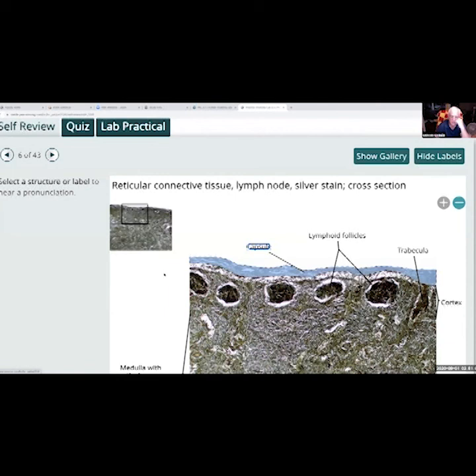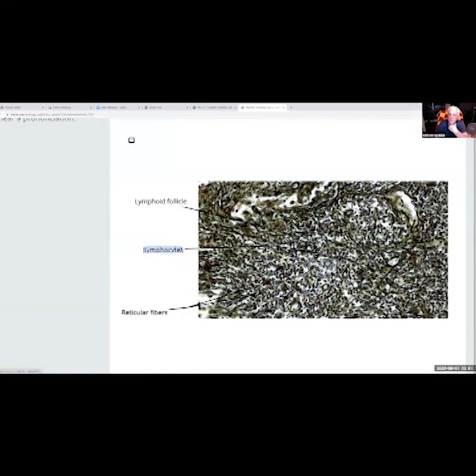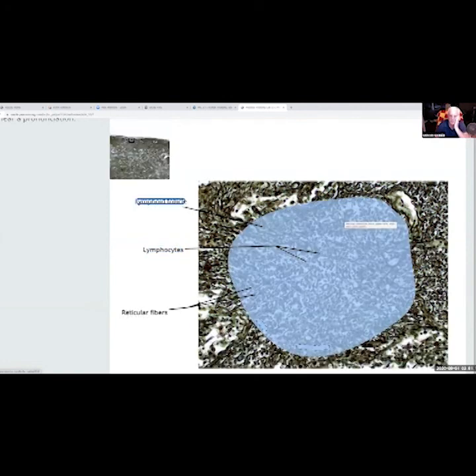Okay, these are your lymphocytes. This is what a lymph node looks like. This is when you get your swollen lymph nodes on your neck right here. When you get infections, this is what swells up. These are lymph nodes. Okay, lymphocytes, what's inside of them. Like I said, don't panic here. We haven't done any of this yet, I don't think.